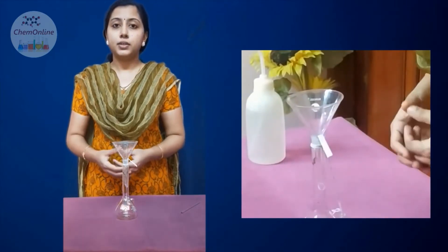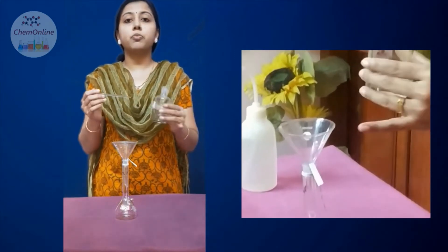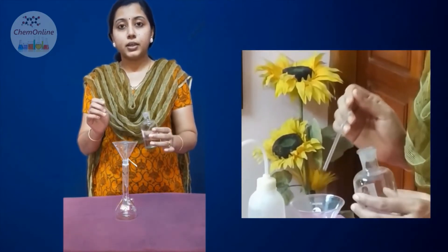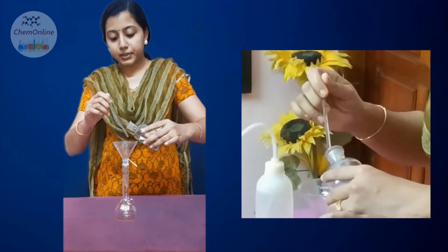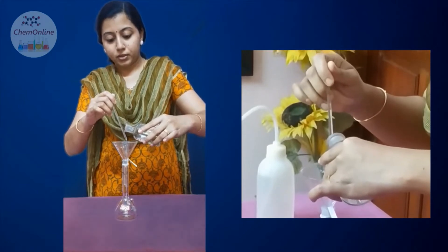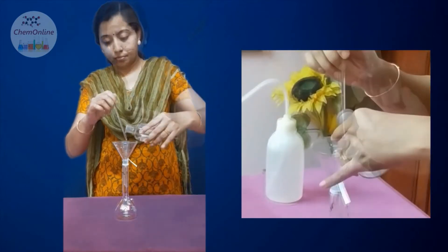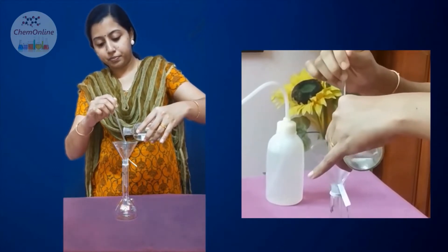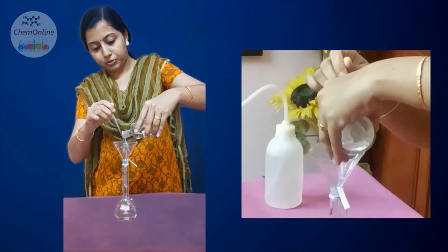Now we have to transfer the solution. Take the glass rod in one hand and the solution bottle in the other. Please remember, you should always pour the solution through the glass rod and not directly, and you should not shake it. Carefully place the solution bottle in position — please see where I am keeping it. The glass rod is kept in a slanting position, and carefully pour the solution into the standard flask.